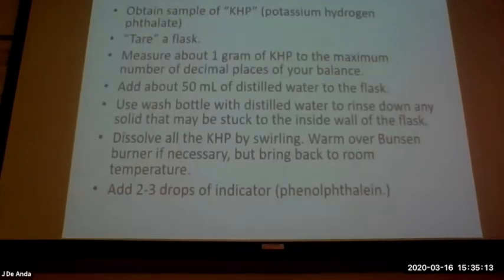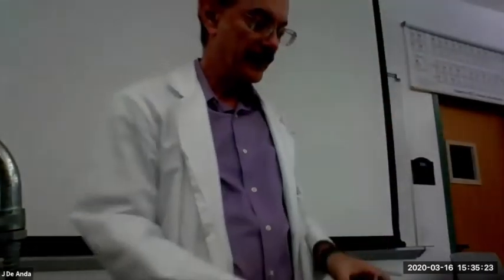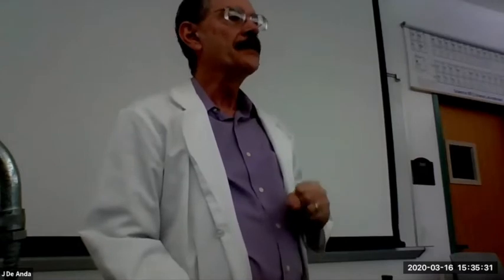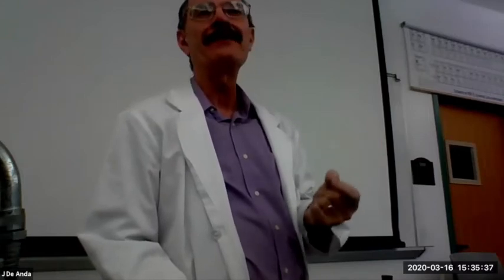Let me blank this out for a moment, and let's come back here and show you how we're going to do this. So today, if you look at your lab manual, you're going to use an acid standard. In other words, this is an acid that is very stable, and it allows you to calculate a very exact number of moles of it.